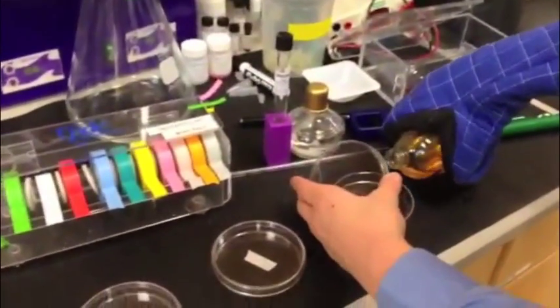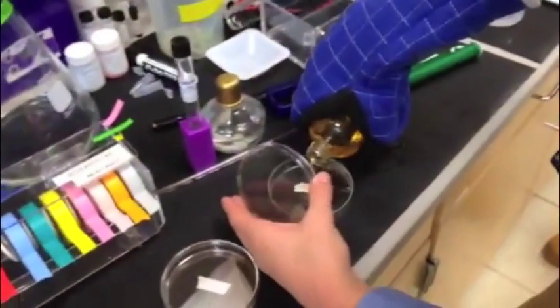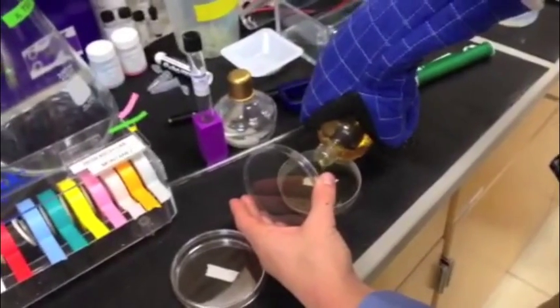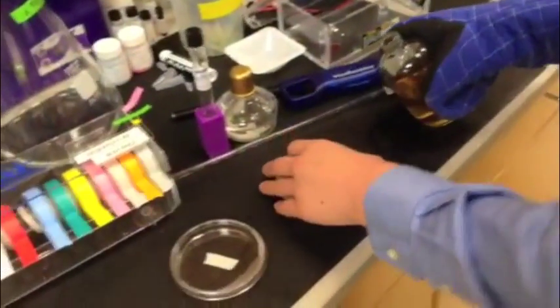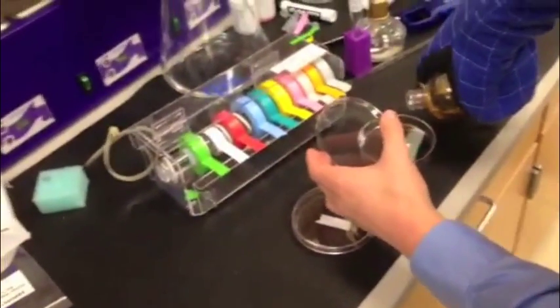Here, as you can see, Bryce is pouring the agar into the first petri dish, our control petri dish, to create a base containing nutrients for the E. coli cultures to grow on and feed off of.